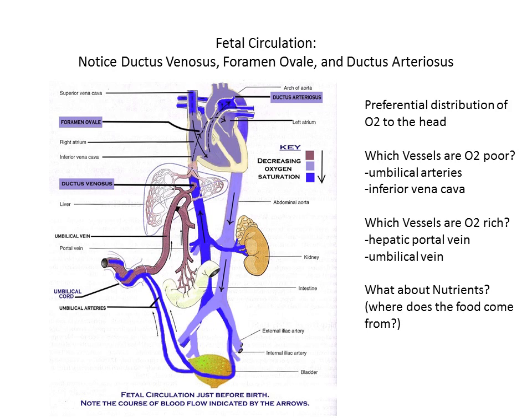So there are two things helping us skip the lungs. Why do we have two things helping us skip the lungs? Because ultimately, neither one does the job completely. Some blood gets loaded into the right ventricle, and the heart is therefore trying to pump that through the lungs. We still don't want to do that. So that little bit ends up getting squirted through the ductus arteriosus directly to the aorta.